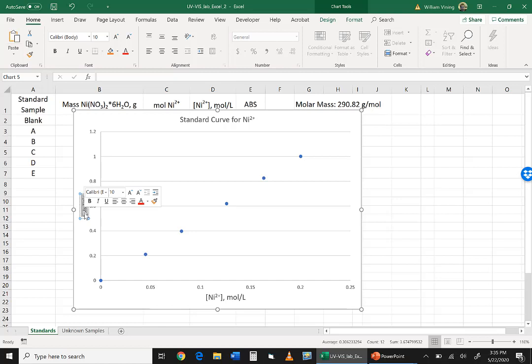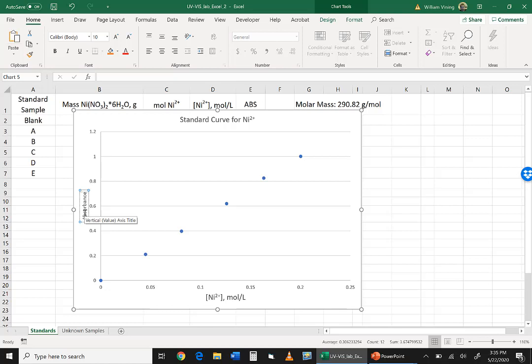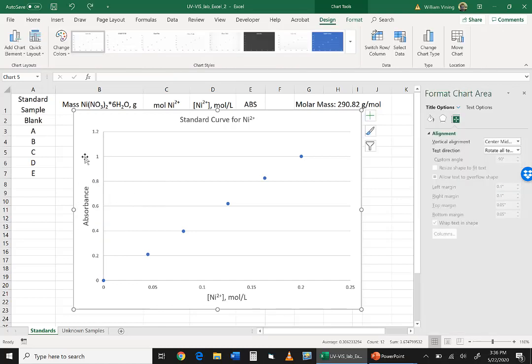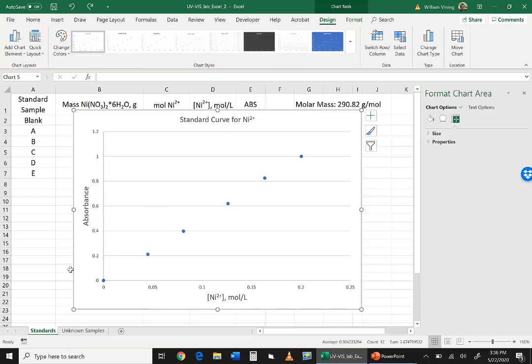Okay. The y-axis is absorbance, and absorbance is its own unit. So absorbance is not any other unit. And so I'll call that, and I'll also make that 14 font.